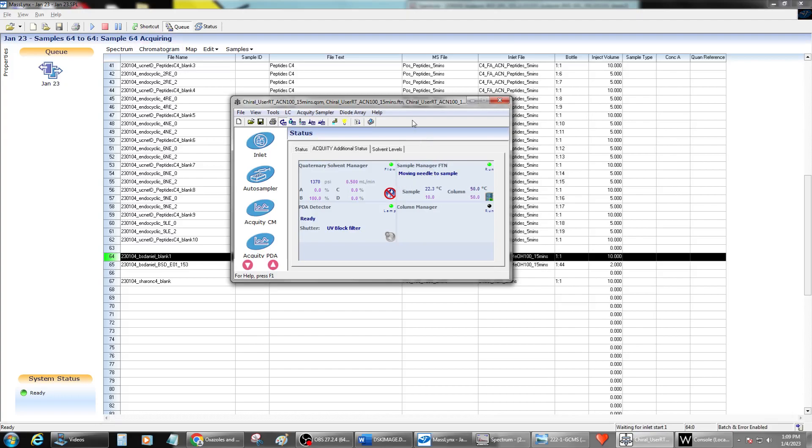But if it didn't do these things and it was just kind of hung up, it looked like it was running, but it wasn't telling you any information. It was just kind of frozen there with waiting for an inlet to start. And it was there far too long. There's something up.